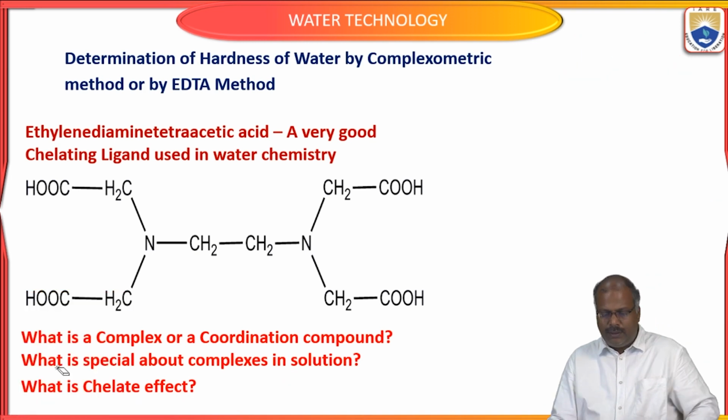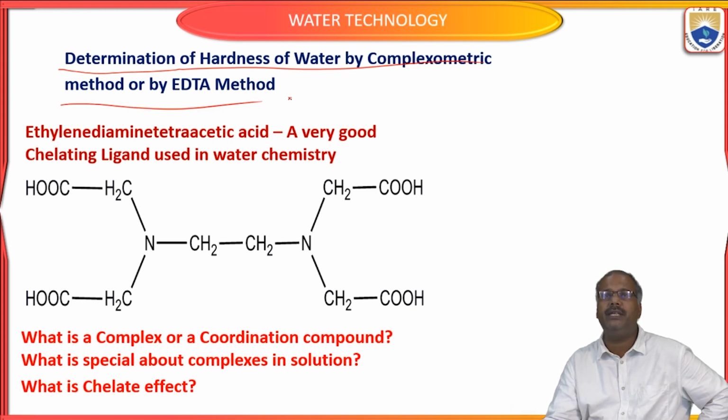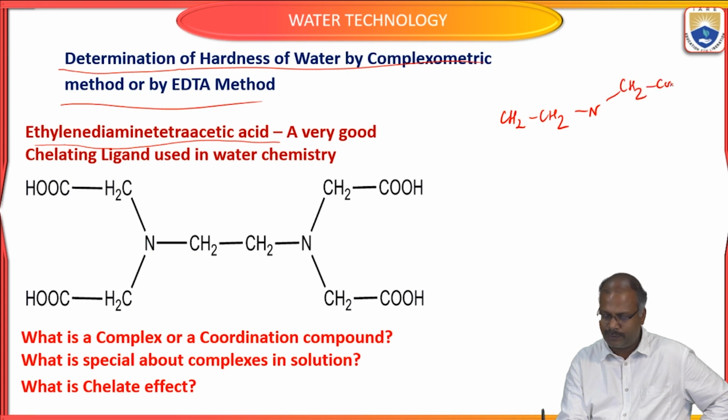Okay, now we come to determination of hardness of water by complexometric method or by EDTA method. EDTA means ethylene diamine tetraacetic acid, or we can say tetraacetate ion. How will they bind?